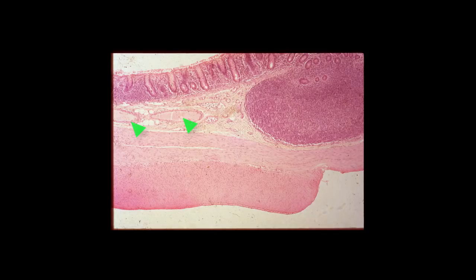You can see some blood vessels and perhaps lymphatic vessels in the submucosa, but I want you to pay particular attention to the Muscularis externa and note the outer layer of the Muscularis externa, how much exaggerated it is. The muscle bunches up into a taenia coli. You may recall in gross anatomy when you dissected the abdominal cavity and looked at the large intestine, you could see three bands running on the outside of the large intestine. Those three bands would be the taenia coli. They're just an accumulation of the outer layer of the Muscularis externa.